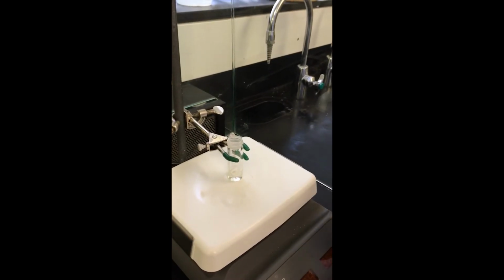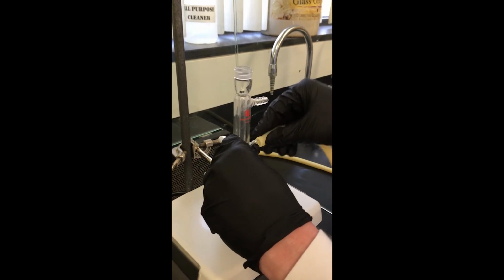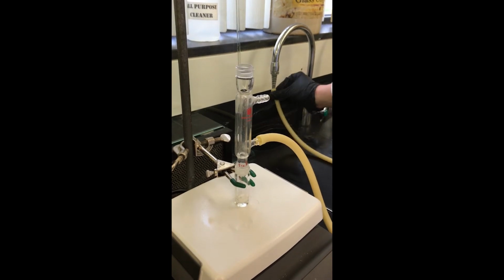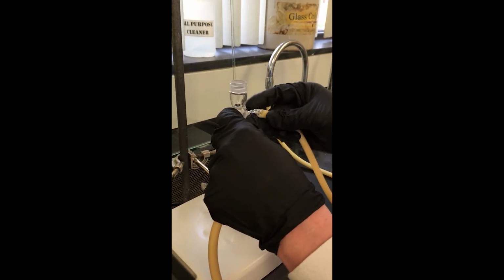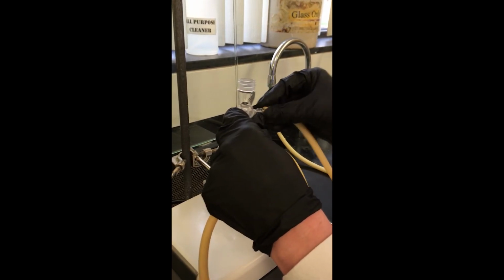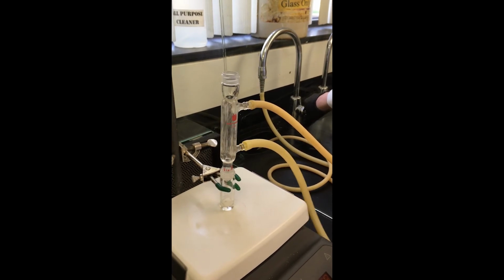Okay, so now I'm going to hook up this condenser. So we're just going to place the condenser and hook up this tube to the sink back here. And then this tube is going to go to the drain. And then we're going to start running water through the condenser.